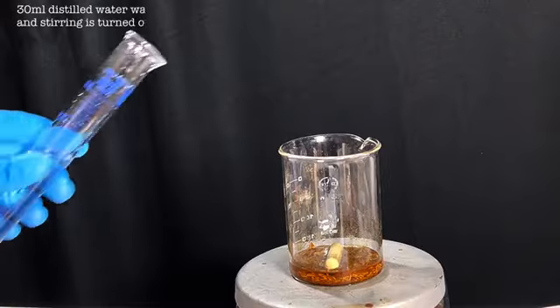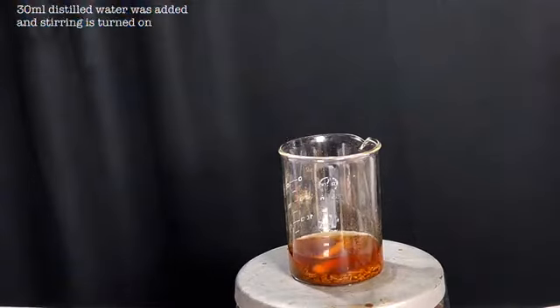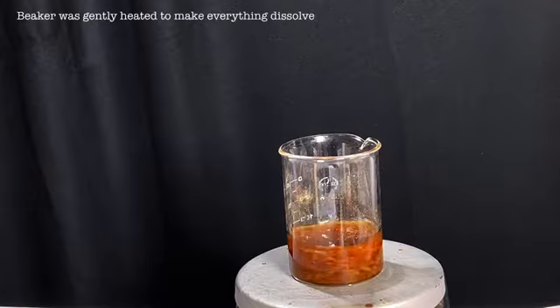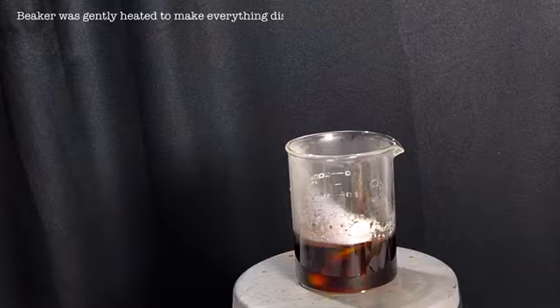Now add 30 milliliters of distilled water and turn on the stirring. Most of the compound should dissolve in the acid. To make everything dissolve, the beaker was gently heated. The solution becomes clear, dark brown in color after the complete dissolution. Now keep the beaker aside.